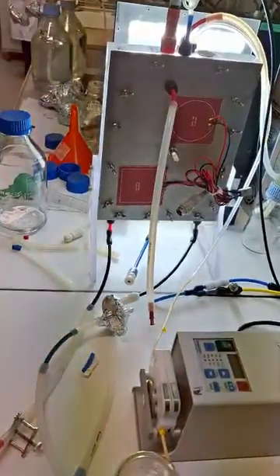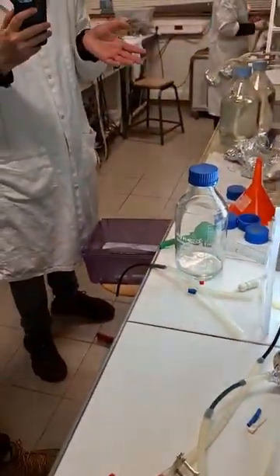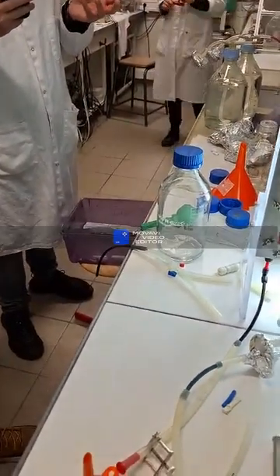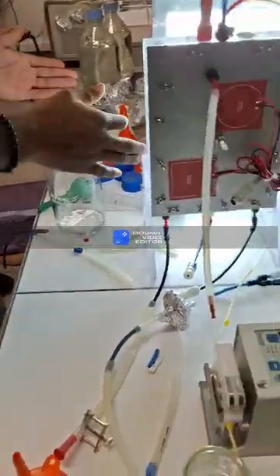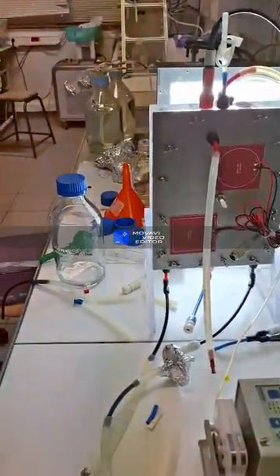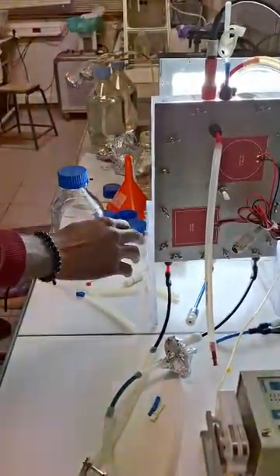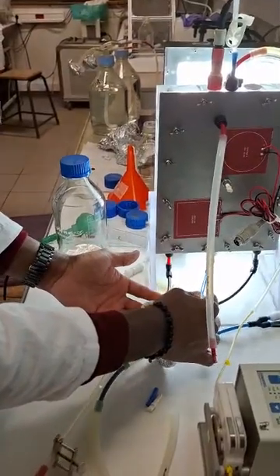So what about the viscosity, that it will change after microalgae produce something? Yeah, viscosity will change. Maybe it will change here, but you will monitor it with the gas flow. This is why we will plug the free air connections.